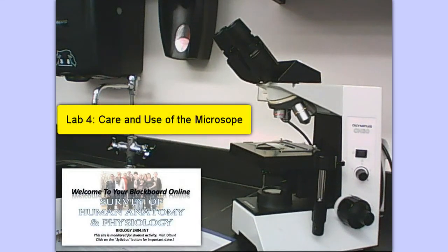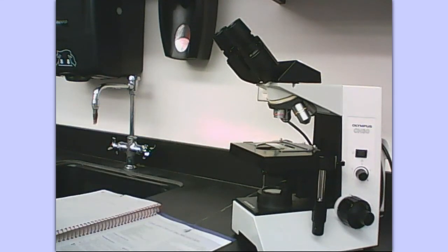Hello. Today we're back in the A&P lab and we're going to look at the care and use of the compound microscope. This is laboratory exercise number four.